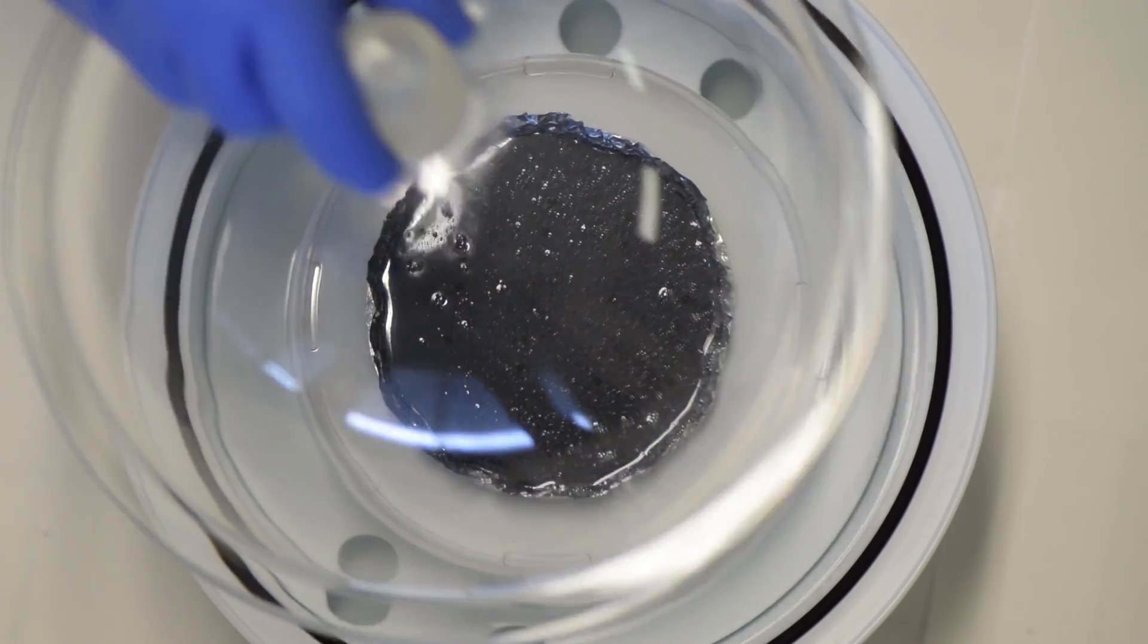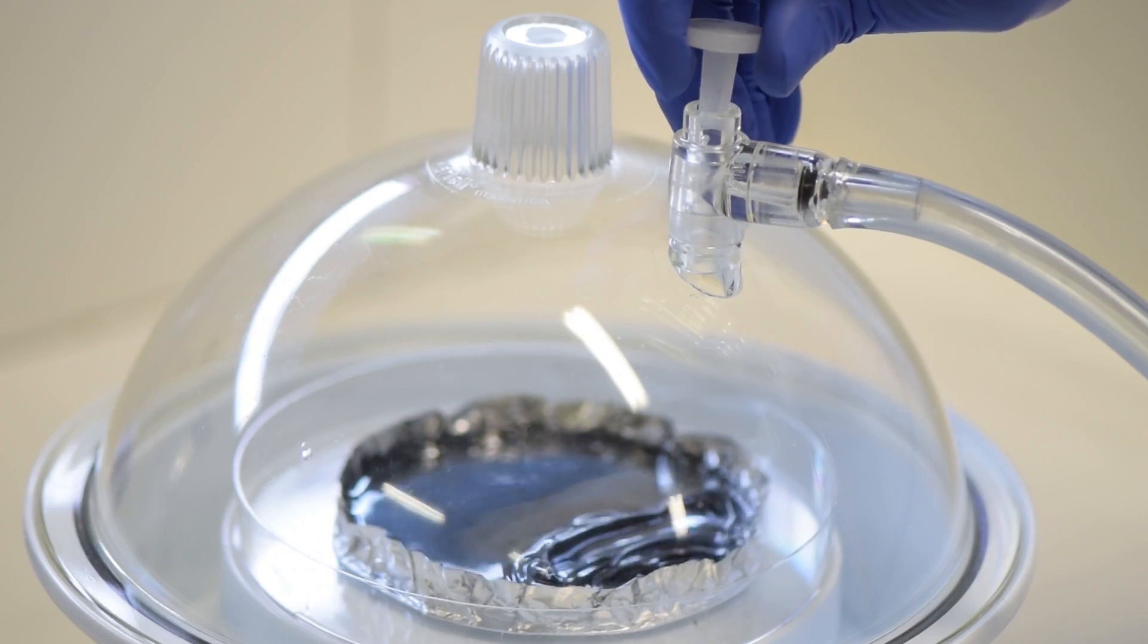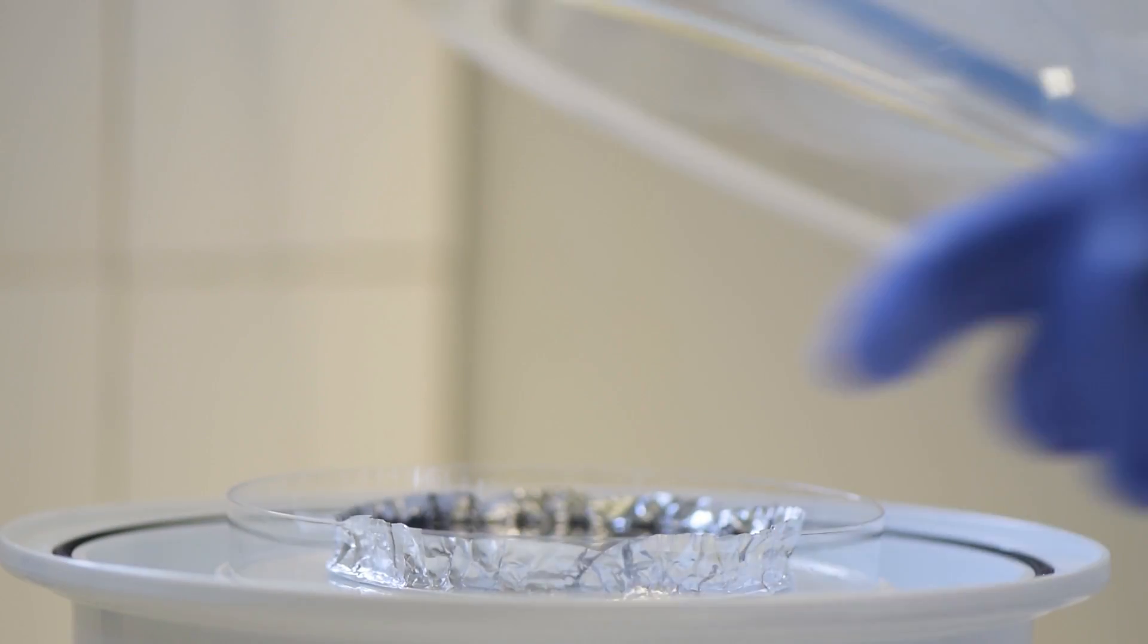The whole setup is put under a vacuum bell to eliminate air bubbles, and then we wait for about 10 minutes. Once the bubbles are gone, we take the PDMS and put it in a heated enclosure to speed up cross-linking.